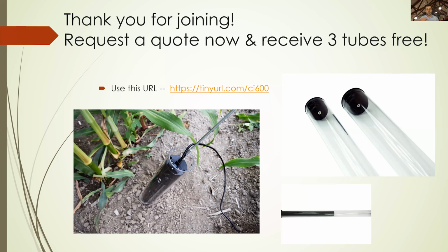All right, the next question is, any reason for not being able to save a traced root image for later viewing and analysis on the computer outside the software? Actually, that's a good question. I think one of the more recent updates with the software has been to be able to save those traced images as actual images. So you see the tracing simply because I was just able to do that for this slide presentation. But if you're asking for the data associated with it, that would be part of the software since it is a lot more data and needs to be handled differently.